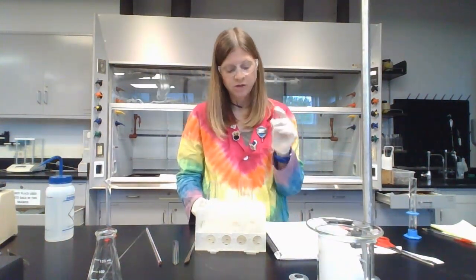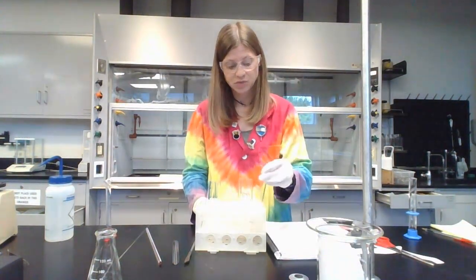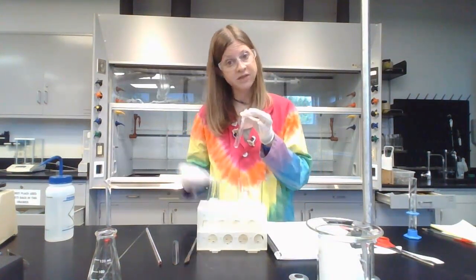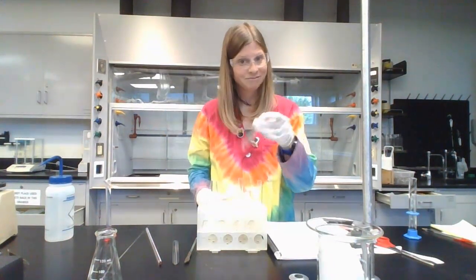There is nowhere to record the mass of this. The reason why I'm having you measure it out is because we need to add enough to make this work, but not too much that it won't dissolve. So that's why we have to measure it. And so you'll label this with salicylic acid. I would say like SA. Then you're going to take your aspirin, and measure out 0.01 grams of that on another piece of weigh paper and pour that into the aspirin tube, like A for aspirin.